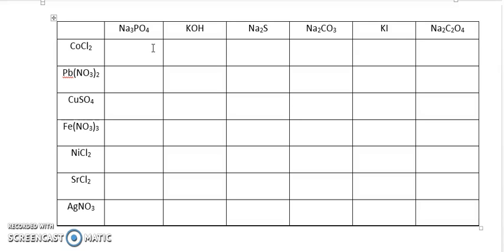We'll talk a little bit more about that later, but for right now, the true purpose of what I need you to see is whether or not a chemical reaction has taken place. So I am hoping that you remember what the 4 signs of a chemical reaction are, because this is the purpose of part 1 of your lab today.